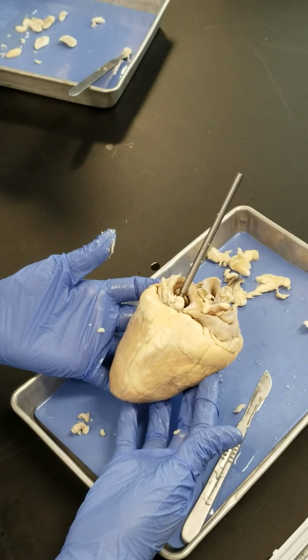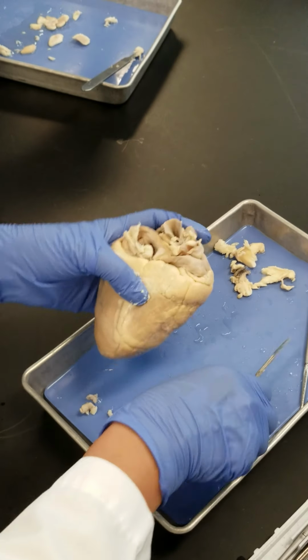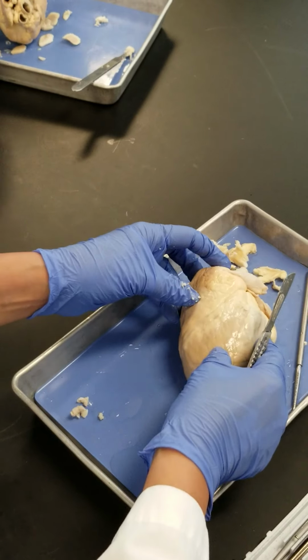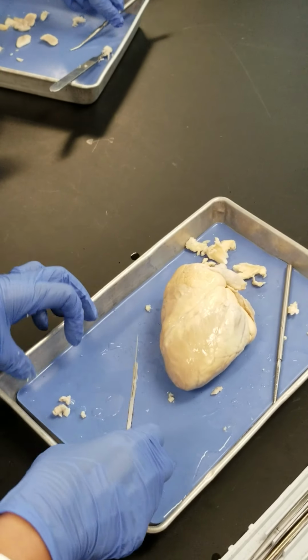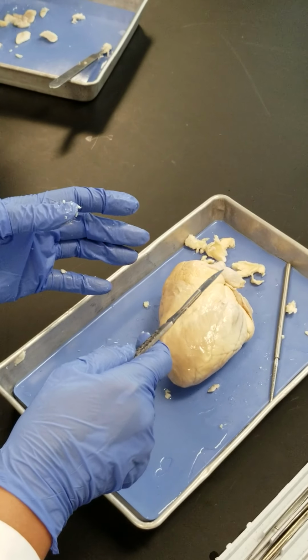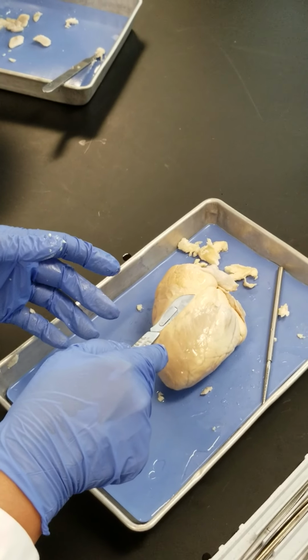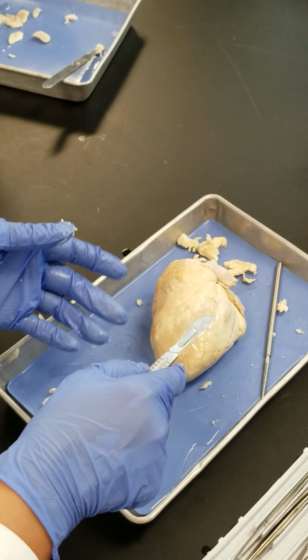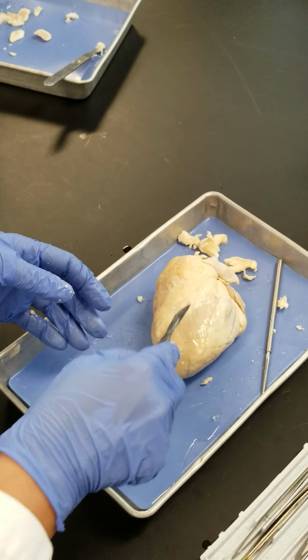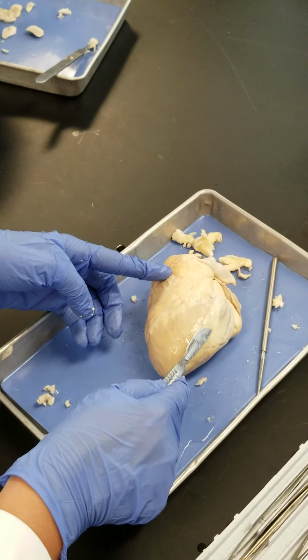Now we want to dissect it and see the inside of the heart. Good? Okay. So you go toward the anterior side. You want to find the border between the ventricles, right? So what should we search for? The anterior interventricular sulcus, right? This is the border between the left ventricle and the right ventricle.